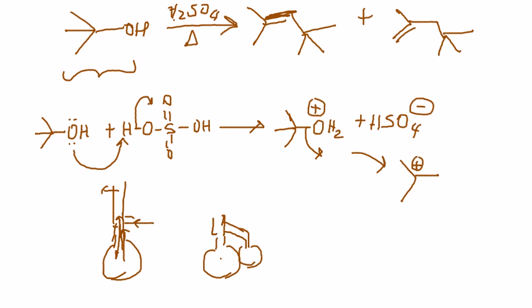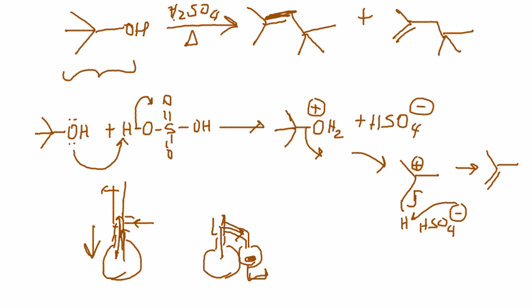So essentially your product, which is isobutene, would rise up. Since it's a gas or a low melting liquid, it would get to the receiver flask and you separate it out. So that is the basic difference: what you did last semester was a beta elimination reaction when HSO4 negative would pick up this proton and give you isobutene, which was what was collected as your product. On the other hand, now this isobutene is going to be thrown back into that acid broth, so it's going to see another reaction, and that's what we are interested in learning about.